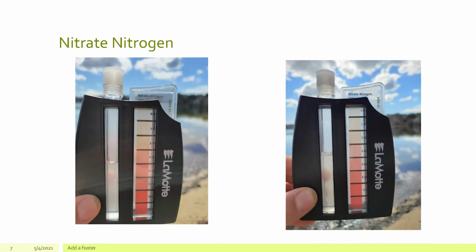Twice during this procedure, I tested for nitrogen. Both times the lake water tested 0 ppm, and the stagnant inlet tested 1 or 2 ppm.